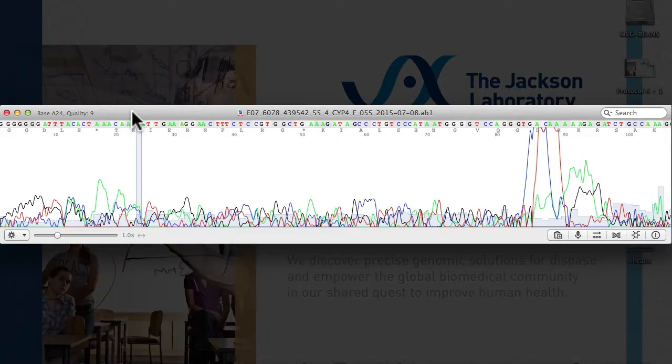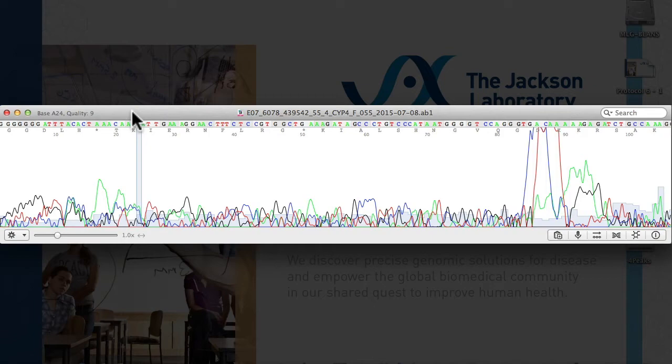When you open the file, there's a lot going on visually. Remember, this data represents the detection of fragments differing by one base pair in size during the process of a PCR reaction that includes dideoxynucleotides. The line traces represent fluorescence levels of the tagged dideoxynucleotides as they migrate through the sequencing machine. The length of time that it takes to migrate through the capillary gel matrix corresponds with the length of the amplified fragment.